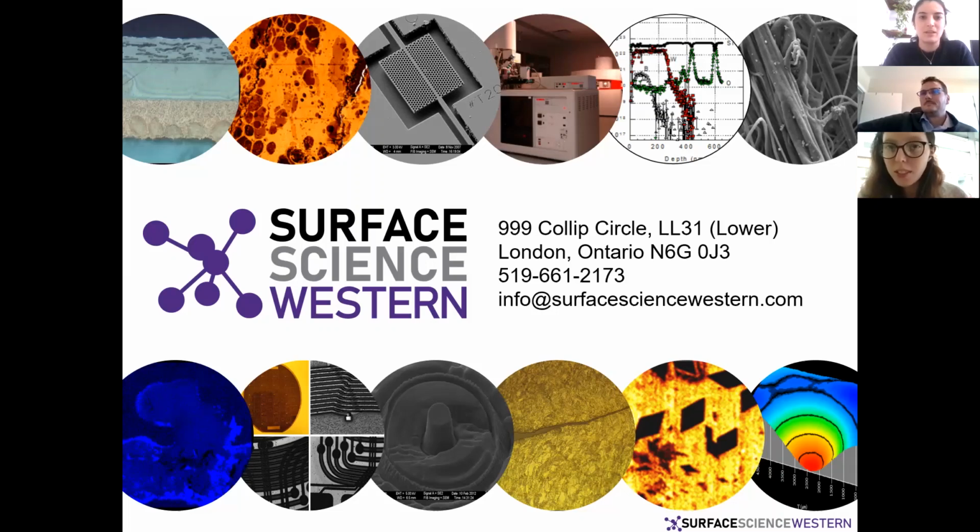Other questions? I have a question. Thank you very much for your presentation. I was wondering, for example, for chromium, you mentioned that we can really detect if it is chromium 3 or chromium 6. Yep. To start, should we use the same FWHM for both the oxidation levels?